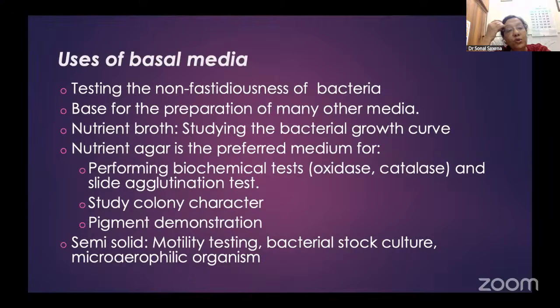Now, what are the various uses of basal media? You can use them for testing non-fastidiousness of bacteria, that yes, it doesn't require anything else. They can be used for preparation of bases for many media. For example, nutrient agar can be used as a base for blood agar.